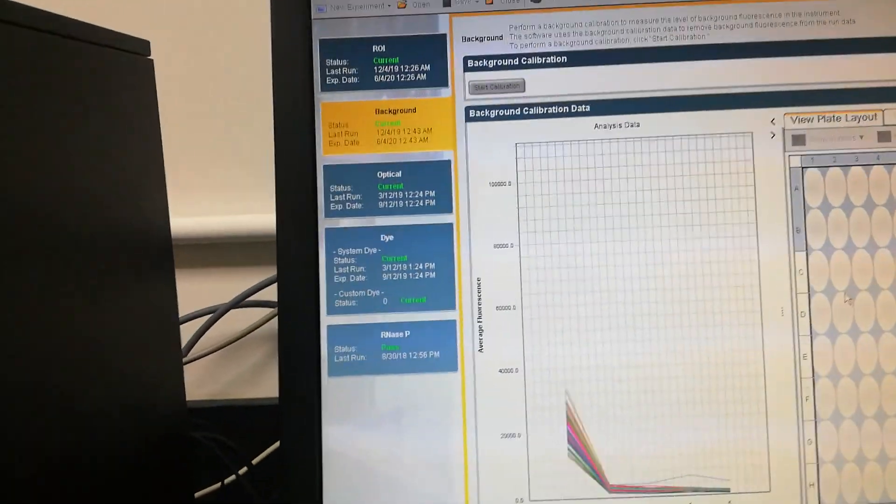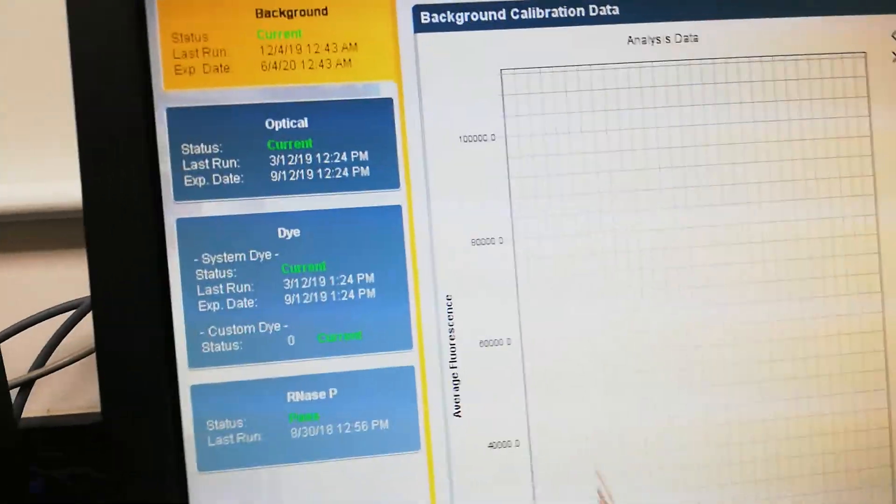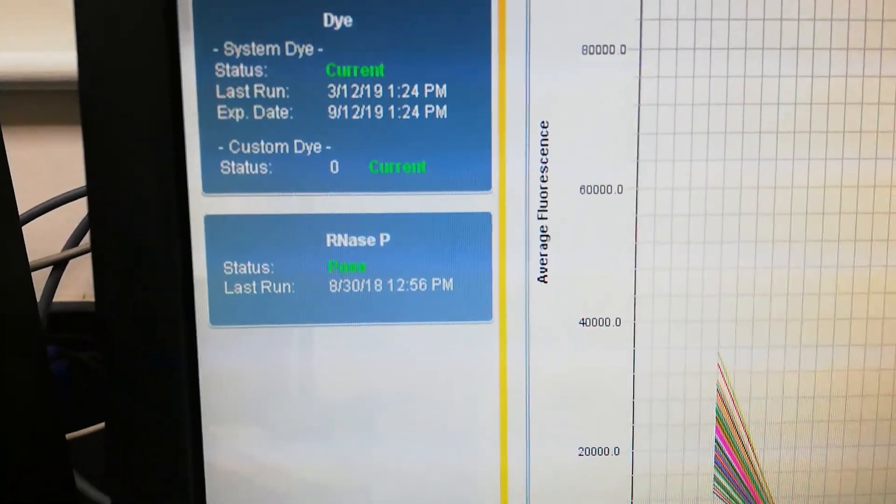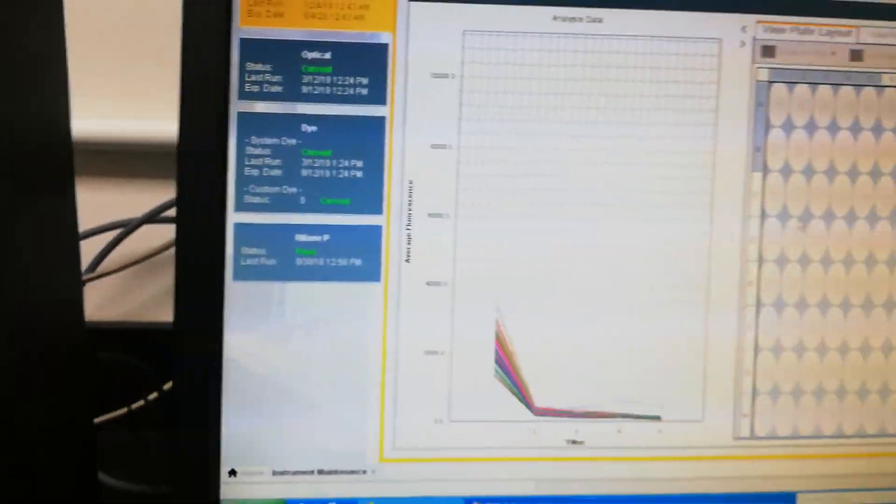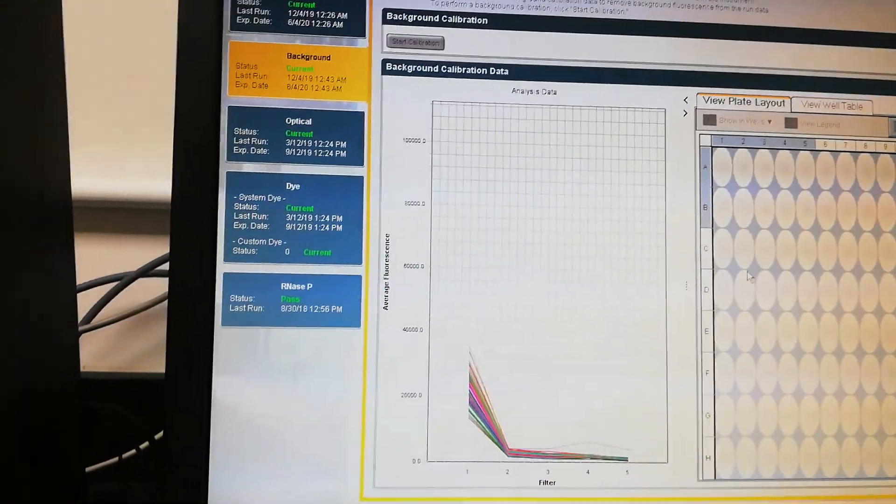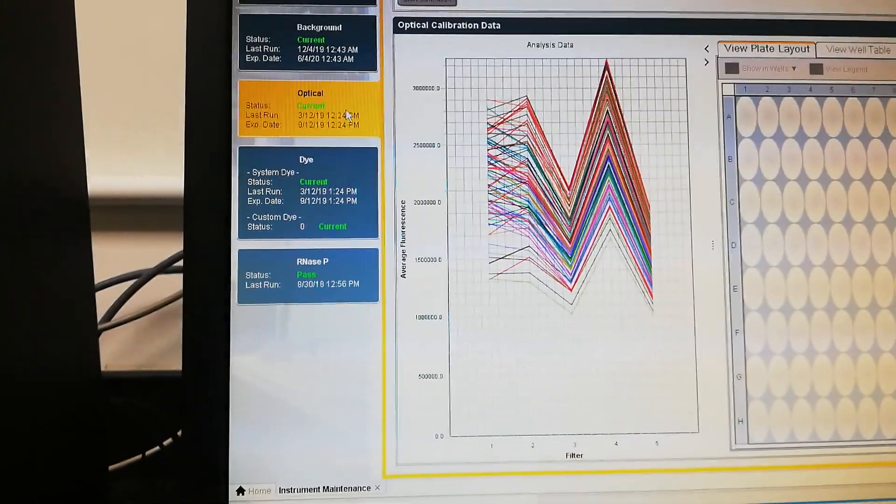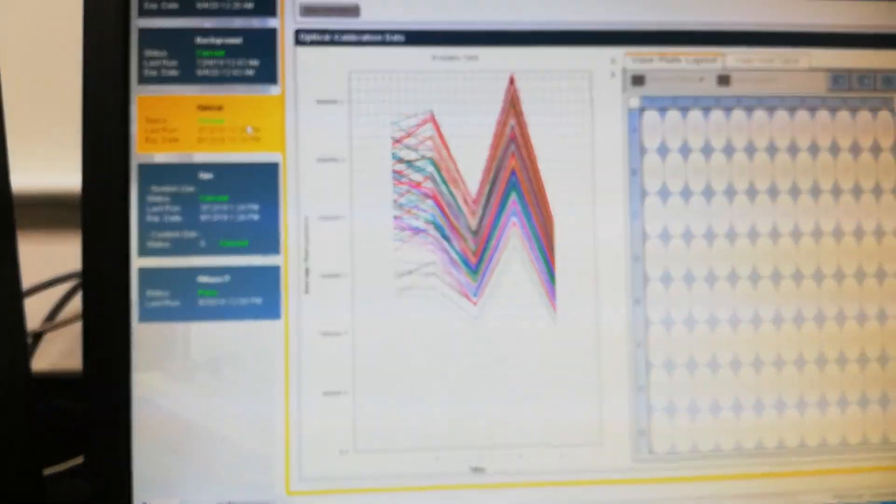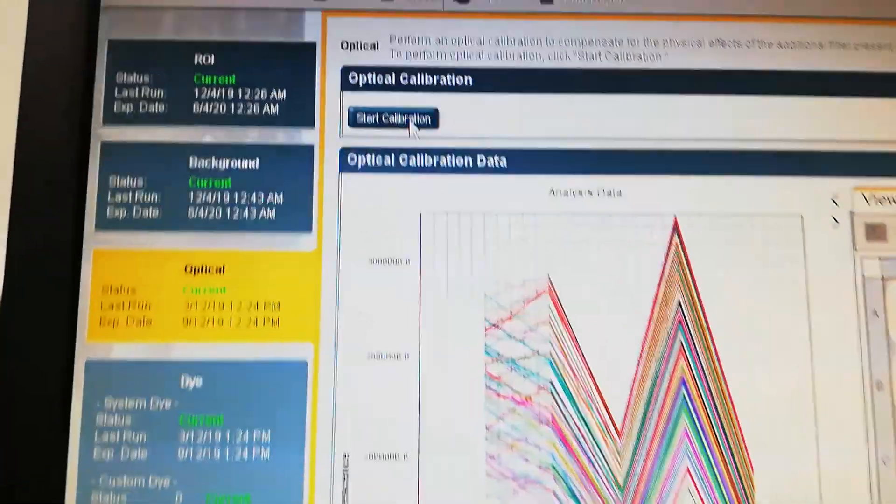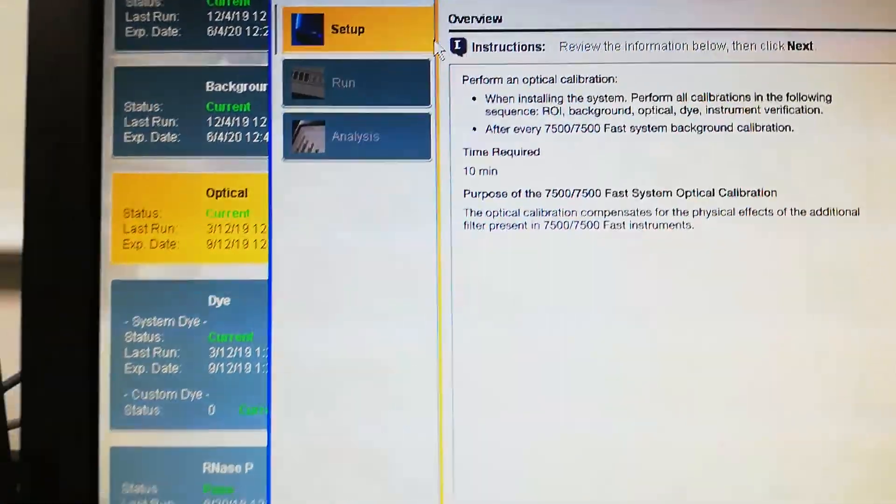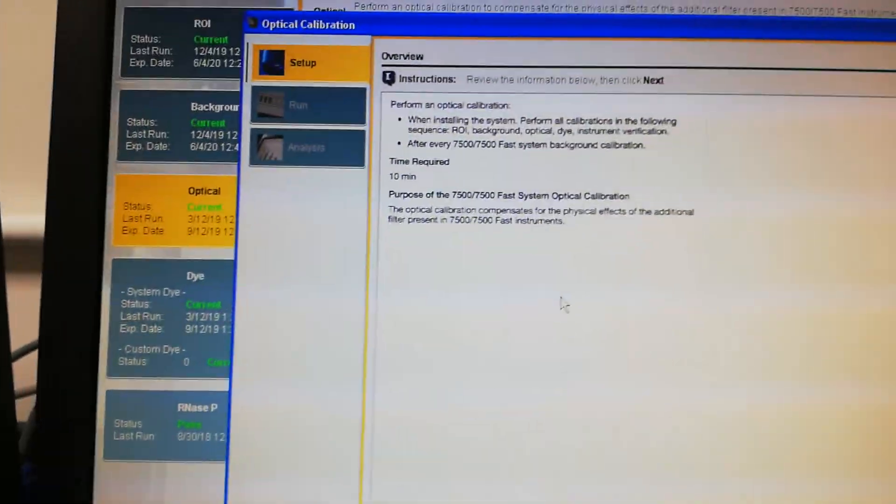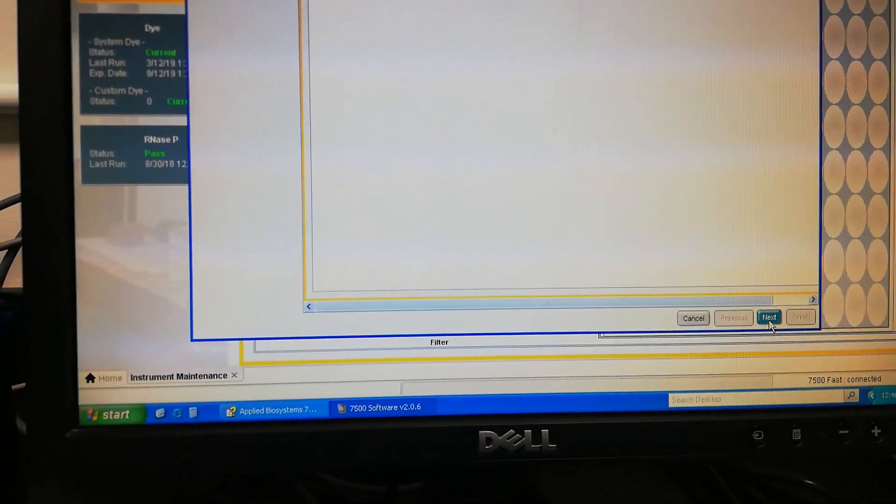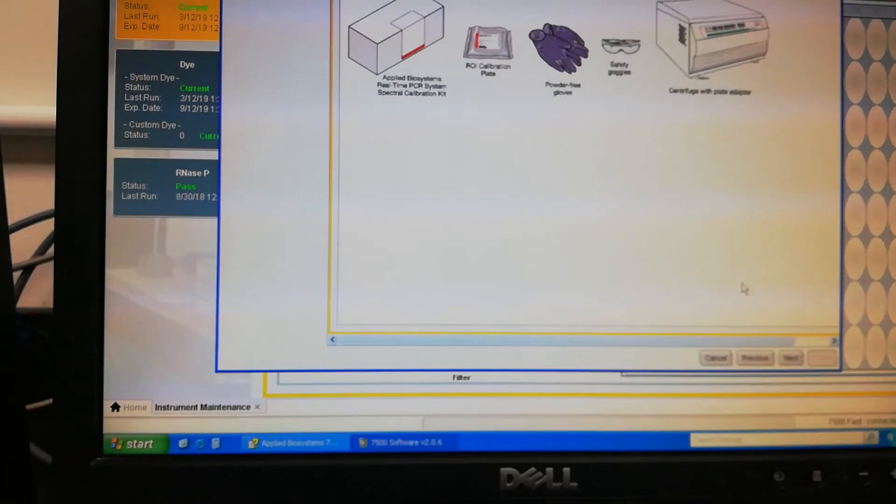Likewise, I will do this optical calibration, dye calibration, and ROX calibration. Now select this optical calibration. Once we select the optical calibration, go to start calibration. Next, it shows the instructions, and then again, following these instructions.